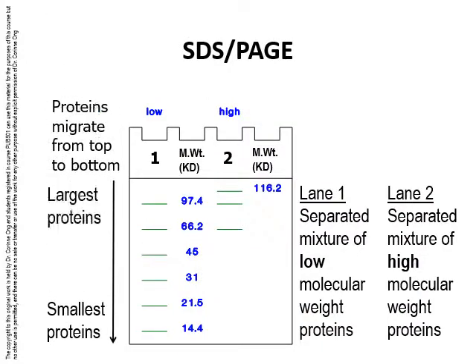SDS-PAGE is used mainly for separating proteins. The principle behind the technique is the use of sodium dodecyl sulfate, which is a chemical that has a long carbon chain and negatively charged sulfate groups. The long carbon chains bind to the protein backbone and coat it with negative charges. When an electric current is applied across the polyacrylamide gel, the protein mixture is separated and travels from the negatively charged electrode at the top to the positively charged one at the bottom.